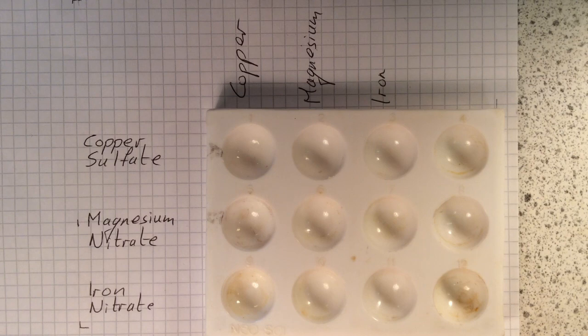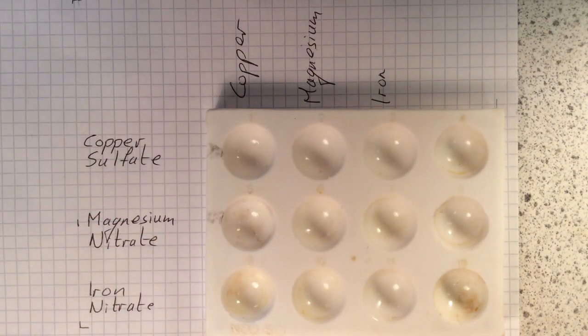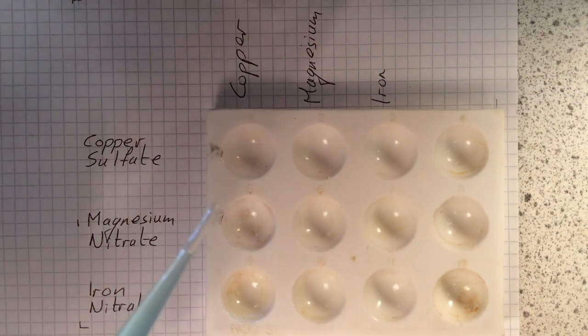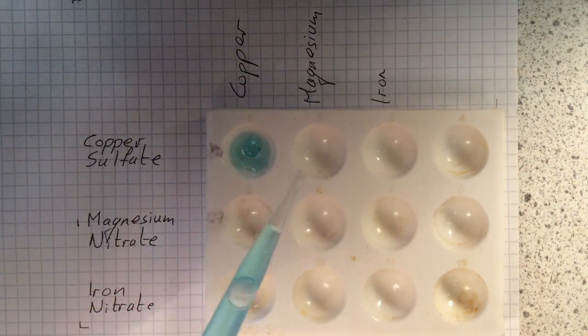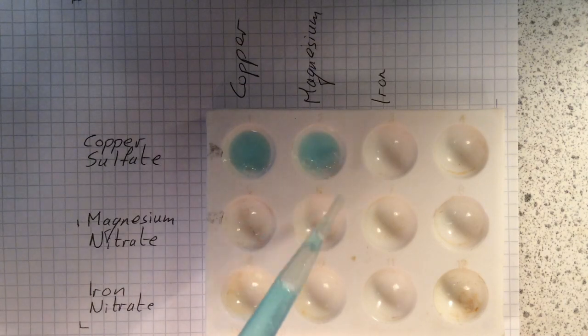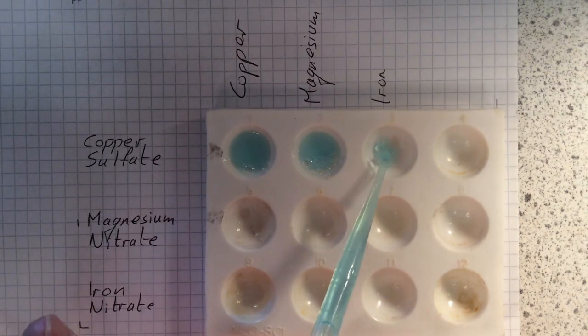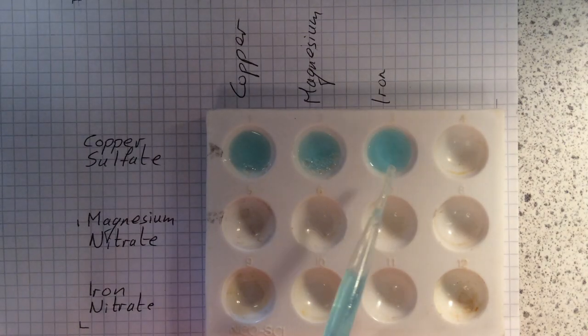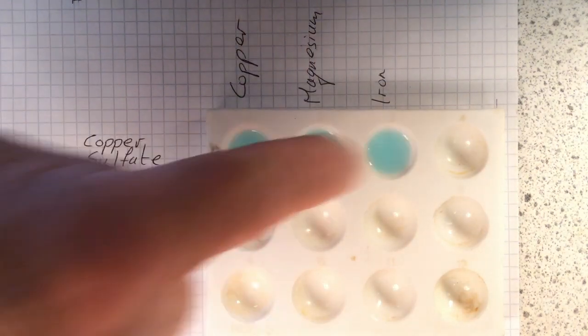Okay, so we are here now at an experiment, and let me show you what we're going to do here. Now these little dimples here are going to take some of the metal compounds. So here is some copper sulfate, which is what I showed you earlier on in the video. So let's just fill up these little dimples with some copper sulfate. So all the ones across here are in copper sulfate.